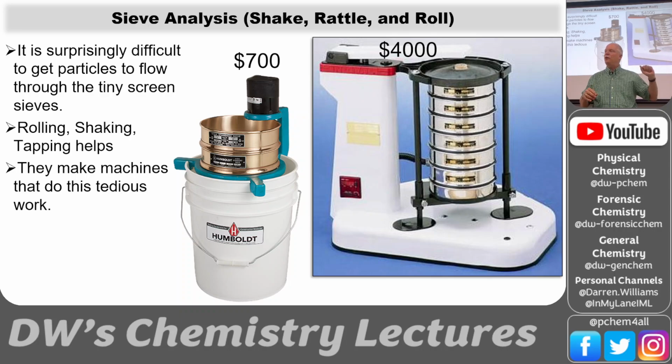You've got maybe an imprint, but you want to verify that yes, this is the exact same soil or silt or clay that's on the questioned item. You take a sample, you could do a sieve analysis on the known and see if they match. They could match chemically. It's the same kind of clay, it's the same kind of silicate soil, but if it's a different particle distribution, then you've got a differentiation.